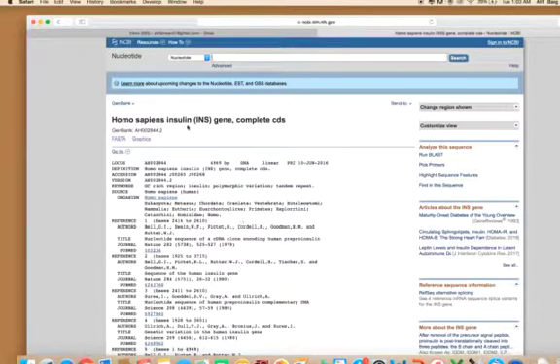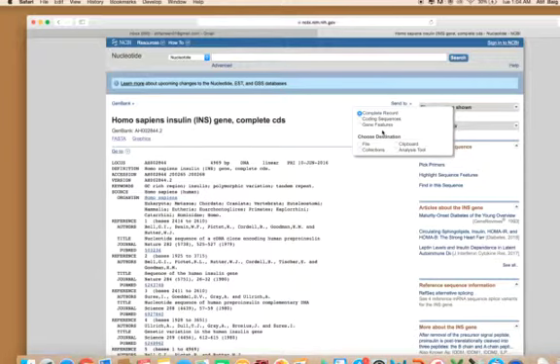Here you have two options. The first option is the GenBank. Under the GenBank you find so many different options, but this is for the purpose of viewing, or for the way you want the presentation to look. So we'll go to the right side, which is Send to. Once you click Send to, you'll find all these options. So it depends on what you're looking for.